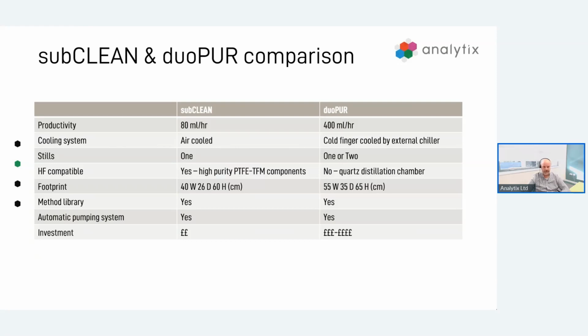Now, we wouldn't recommend having one platform that had solvents and acid use because you would run into issues in terms of making sure all the lines were clean. But if you did want a dedicated platform for acid and a dedicated one for solvents, then the easy fill can actually accommodate that.